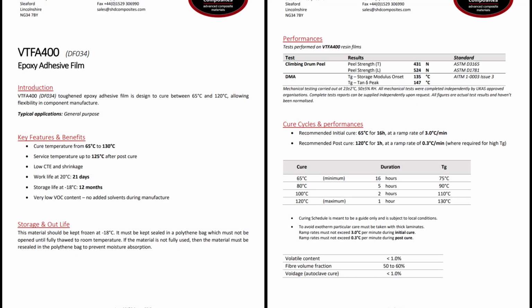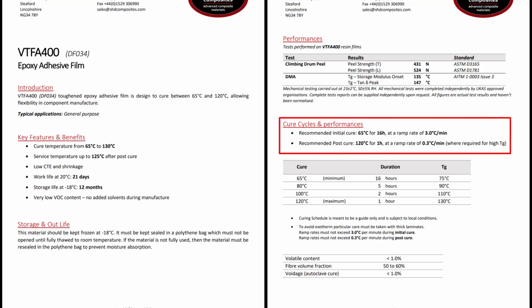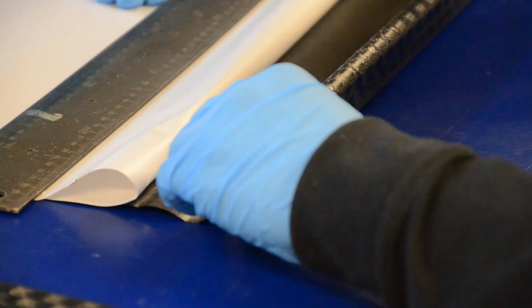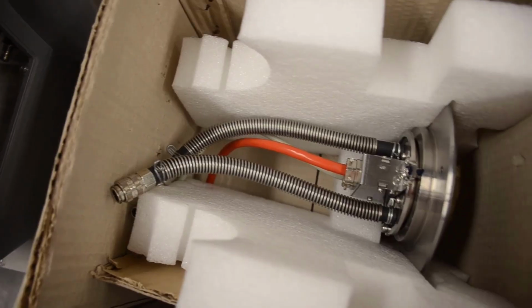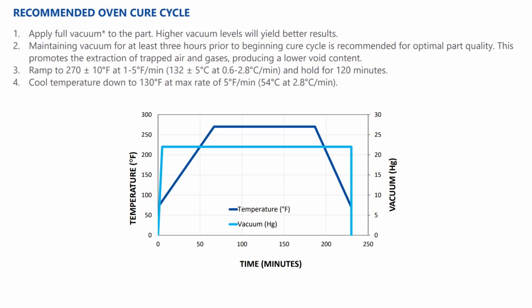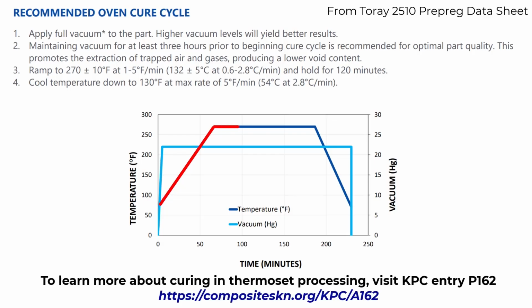Another common use of the rheometer is characterizing thermosetting resins which cure when heated. These resins are commonly used in prepreg fiber composites and adhesive films which are cured in an oven or autoclave. The heated cure cycle can be replicated with a rheometer environmental chamber or temperature-controlled measurement geometry. A heated cure cycle typically involves a ramp up to temperature, followed by a hold for a length of time at cure temperature and a ramp down to room temperature.